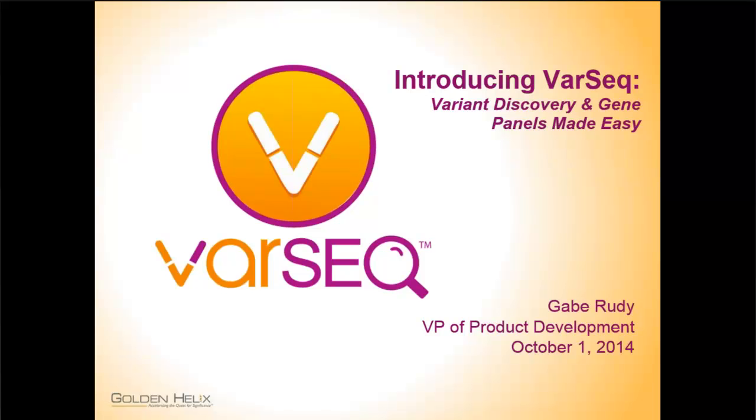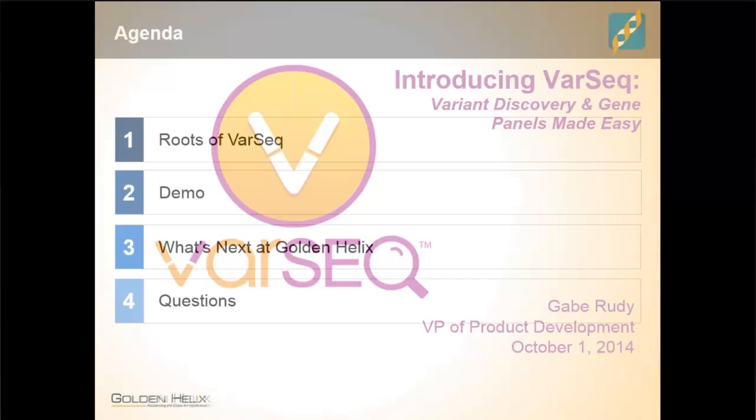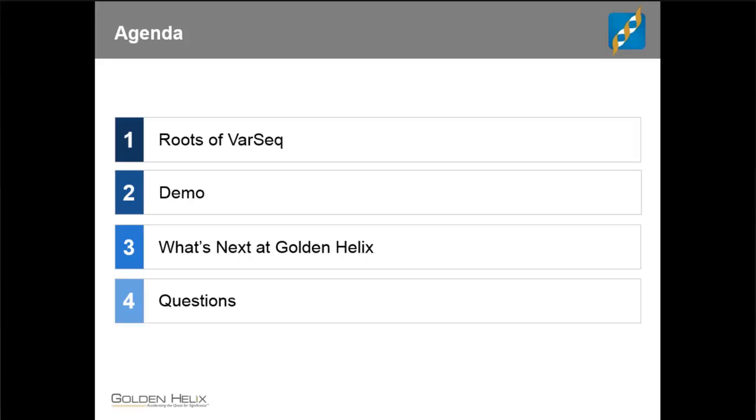So to give you a little bit of an agenda to ground what we'll be doing today, I'm going to spend a little bit of time talking about the roots of VarSeq. Andreas gave you a great overview of how Golden Helix is entering this market and what our strategy is, but I can talk a little bit about the technical and product development process that brought us to the point of releasing this first version of VarSeq, and how it's quite unique as a first version of any tool.